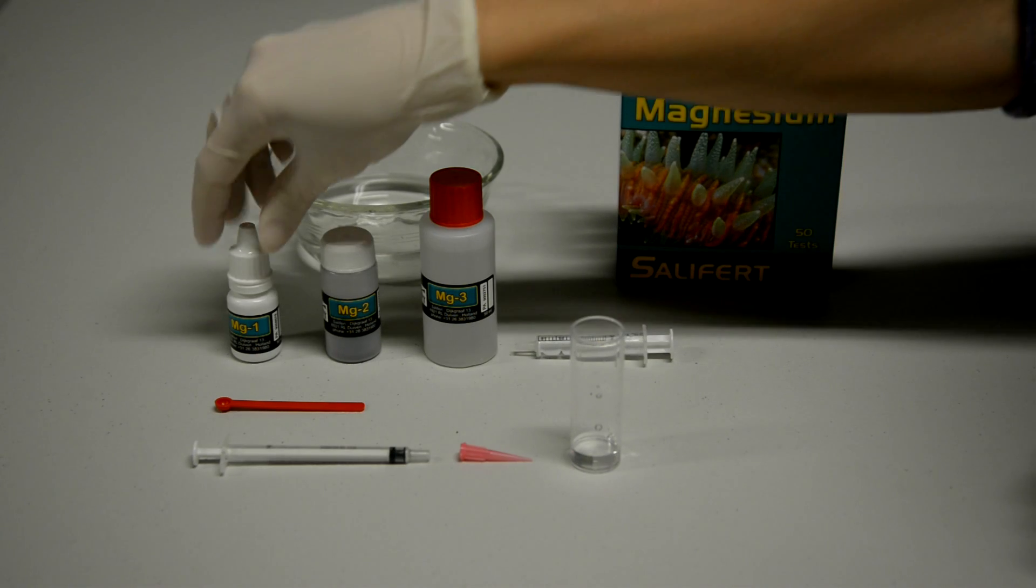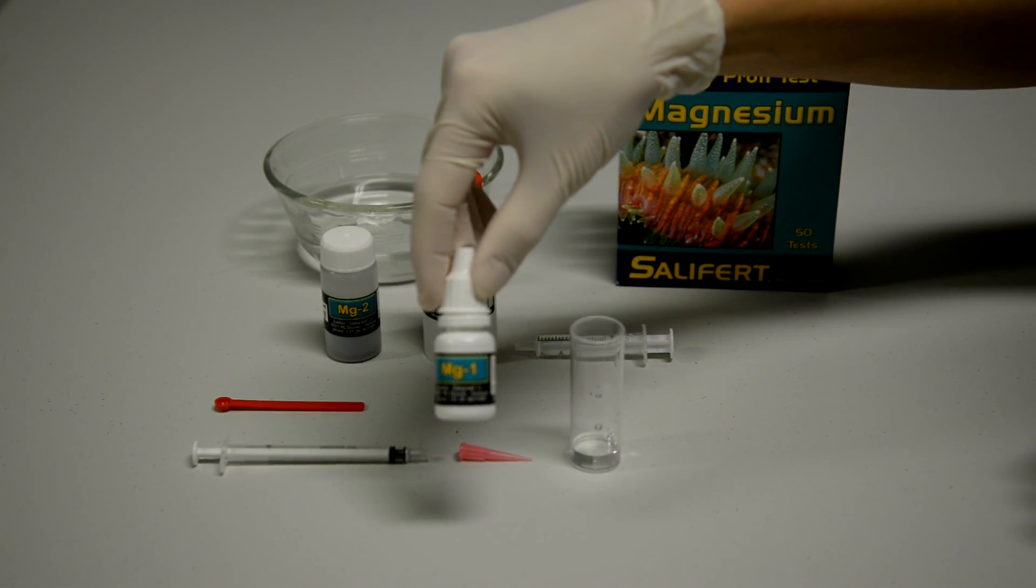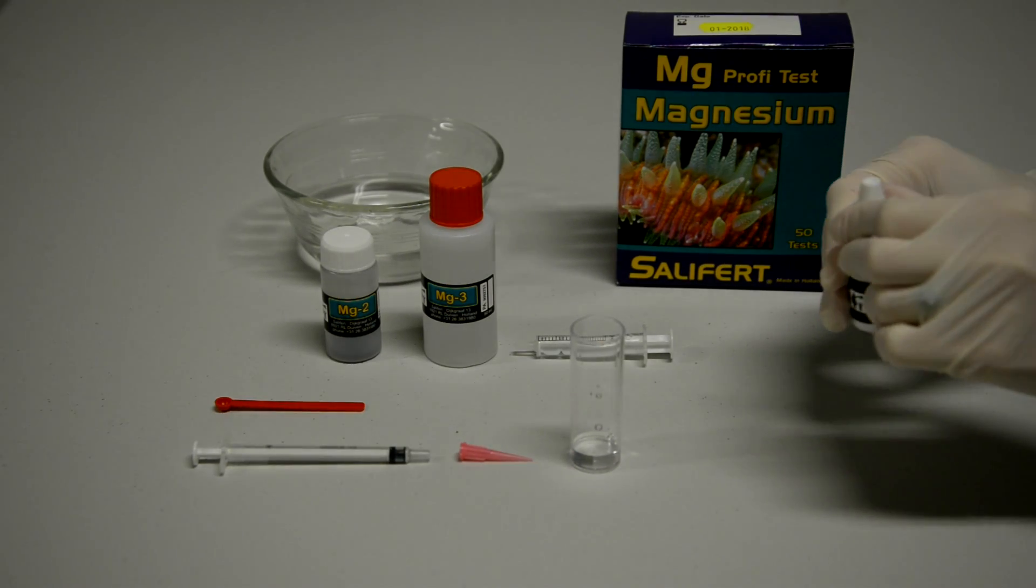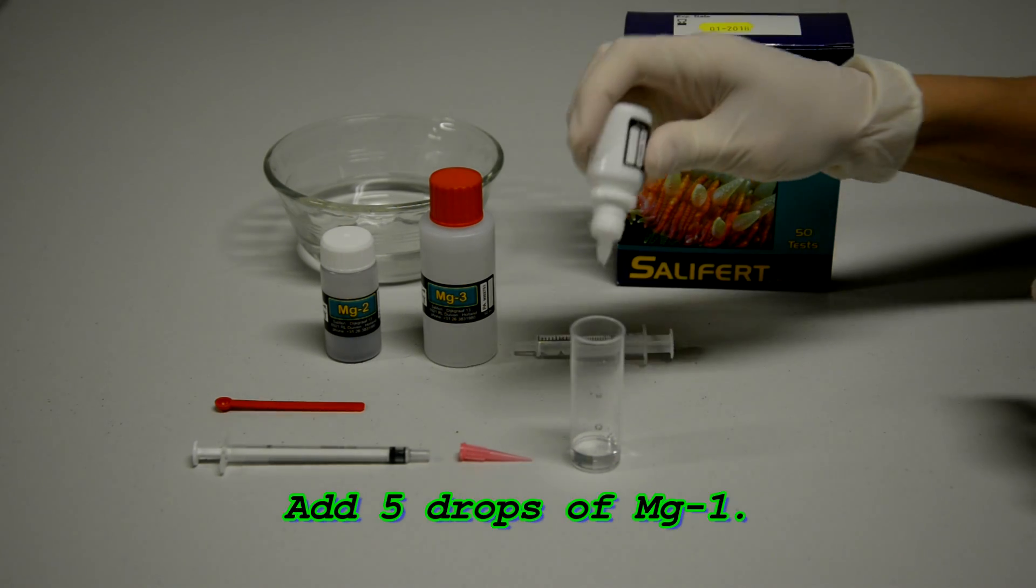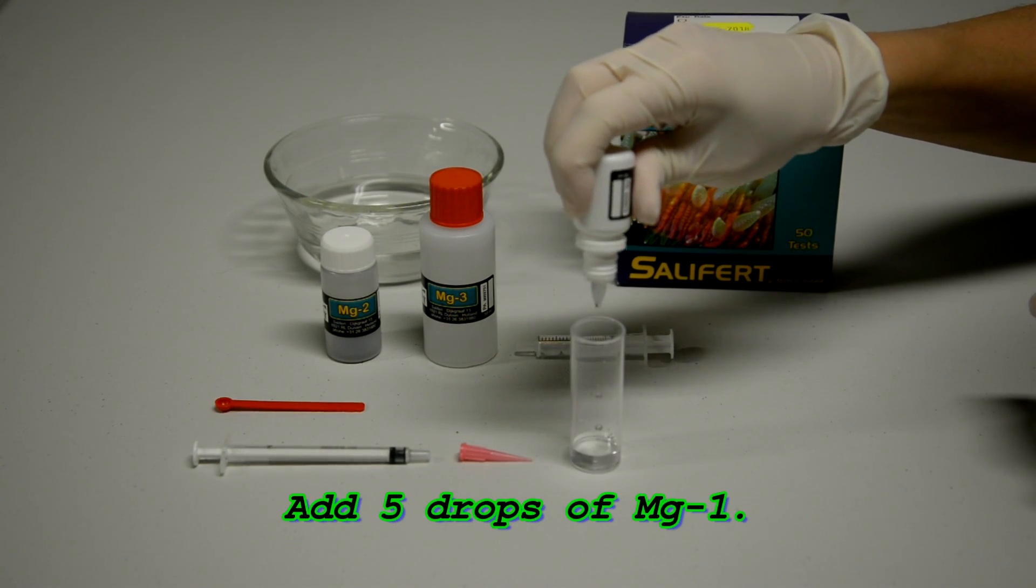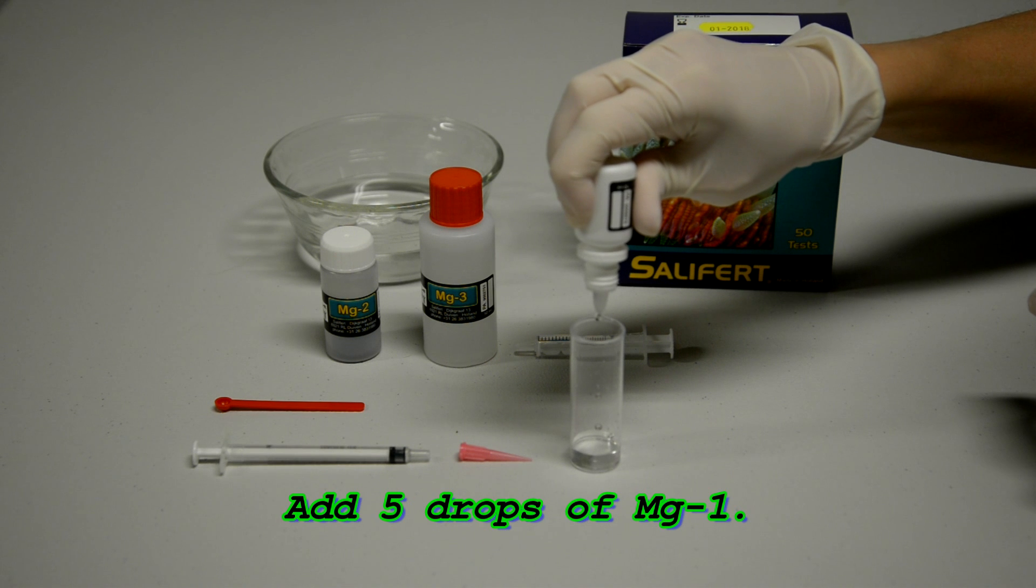After that, they've labeled them nicely in order, we're going to add magnesium 1. So when we add this, we want to be sure that we're holding our dropper as straight up and down as possible, add five drops.